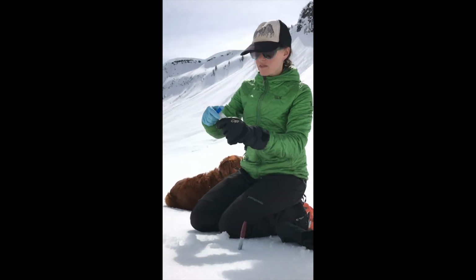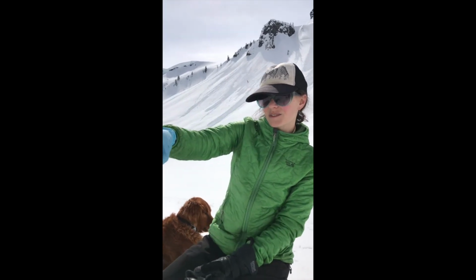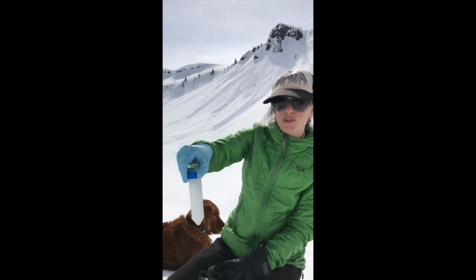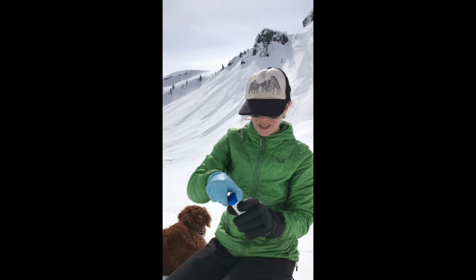Okay, that's pretty full. I don't know if you can see that. This sample doesn't have a lot of snow algae on the surface, so it just looks white. If you have a really pink sample, this whole tube will look really pink or even red.